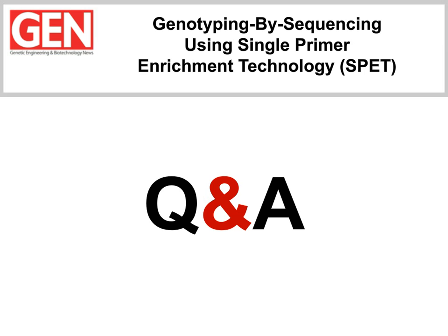In this case, the information is coupled with the random 6 bases provided by the index sequencing, and so given the random 6 bases plus the position of the forward read, the removal of the duplicates is 100% unambiguous.